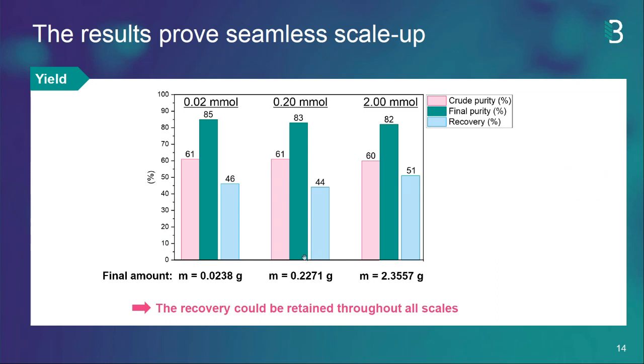The same was basically obtained in terms of yield. So when you look at the final amounts that we were able to get after purification of the individual scale, it was pretty much the same. And the recovery was also retained throughout all 3 scales.